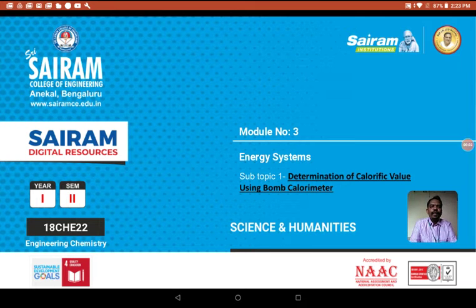Good morning. In our previous discussion, we have discussed calorific value and types of calorific value. So today we're going to discuss how to determine calorific value of a solid or liquid fuel using bomb calorimeter.